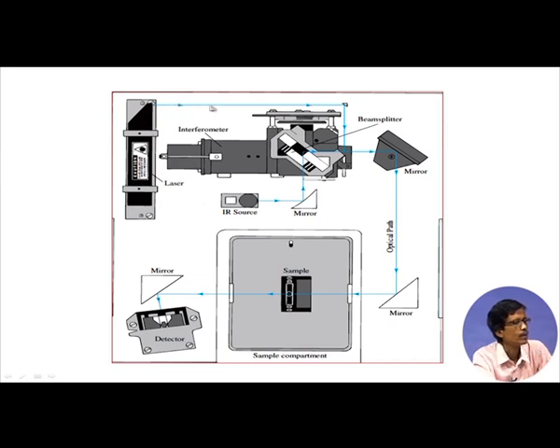It is coming from here with another triangular mirror, and then it is guided through this and again to this particular thing. That means you have the corresponding beam splitter. The beam is getting split, and the whole thing happens within this interferometer.